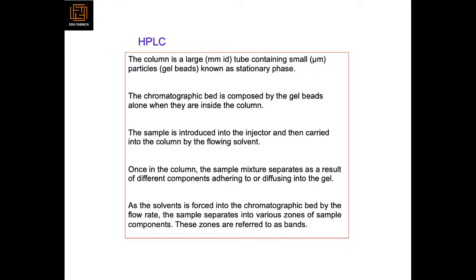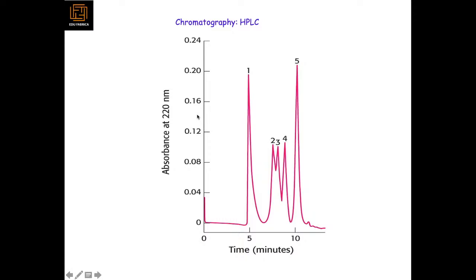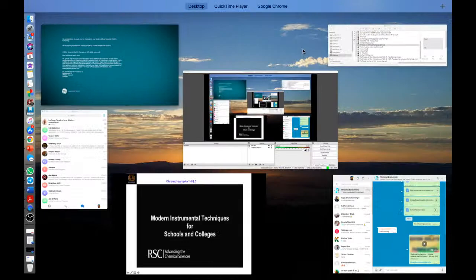So this is how we get these resolutions, with different absorbance at 220 nanometers across 10 minutes of time. These belong to various peaks, various samples that are being separated. So let's see the last content of today.